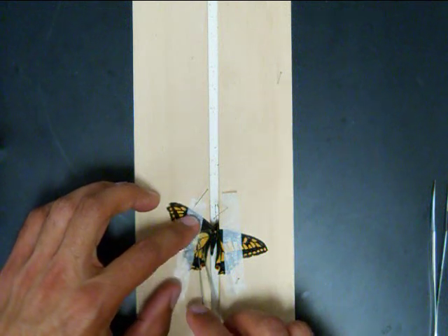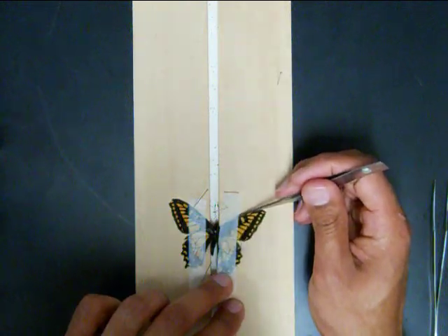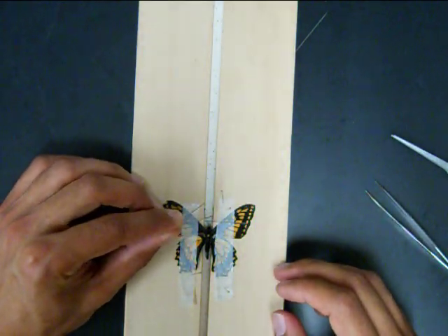After spreading the two wings, secure them with the glassine strip. Follow the same steps to position the right wings. Finally, use some pins to position the antenna and leave the insect to dry for at least one week.